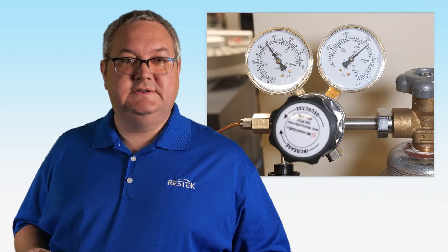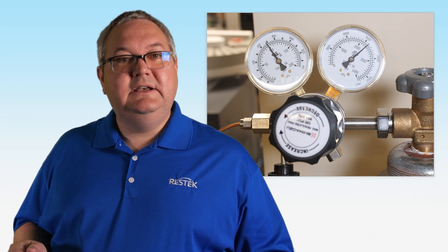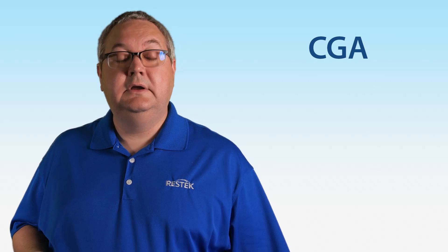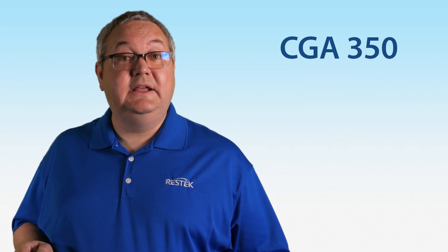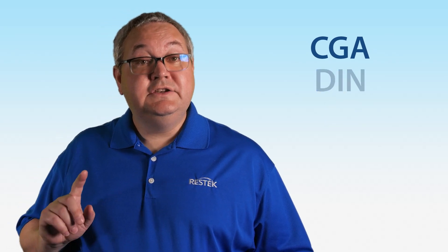Let's begin with cylinder connections. The type of connection, or fitting, that you need generally depends on the type of gas and the amount of pressure. In the US, the Compressed Gas Association has dozens of fittings that are part of their CGA standard. A CGA 580 fitting is used for helium, nitrogen, and argon, while a CGA 350 fitting is used for hydrogen. Other organizations also have their own fitting standards, which are used by different countries. Check what fitting type your gas cylinder has before trying to select the type of regulator that you need.